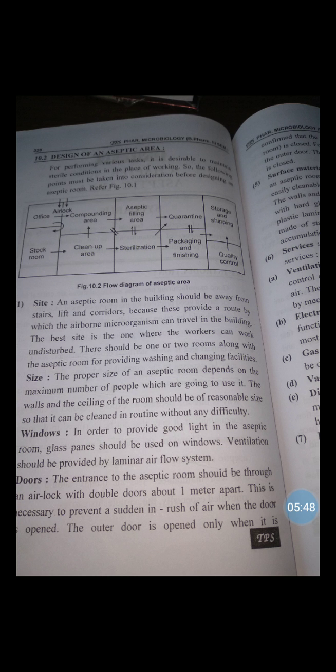Indoors, the entrance to the aseptic room should be through an airlock with a double door about 1 meter apart. This is necessary to prevent a sudden rush of air when the door is opened.